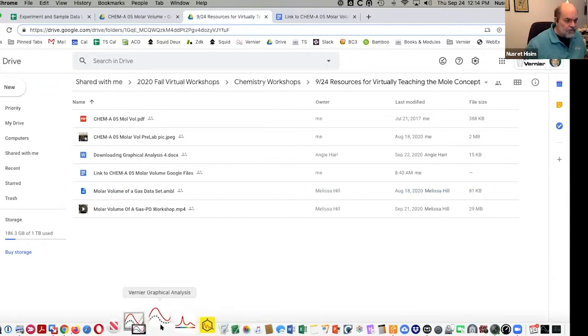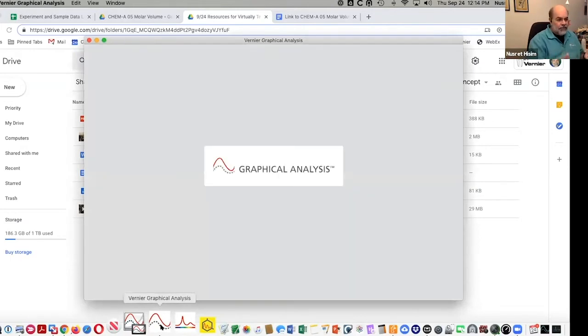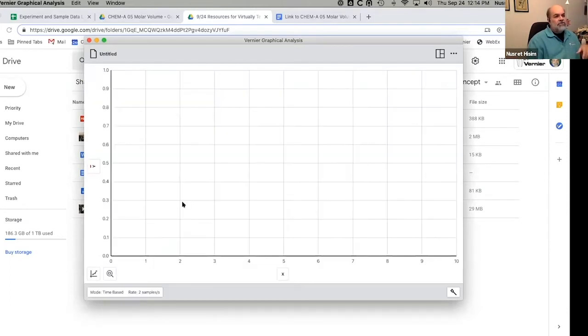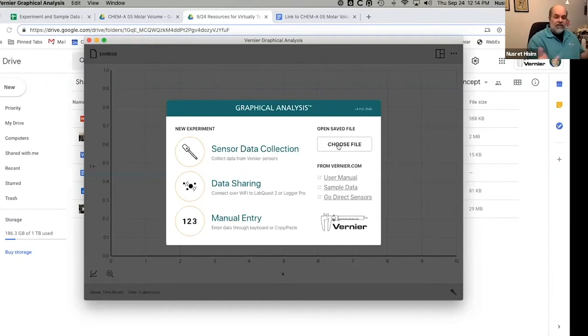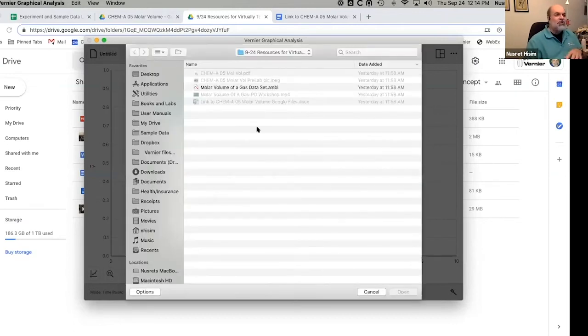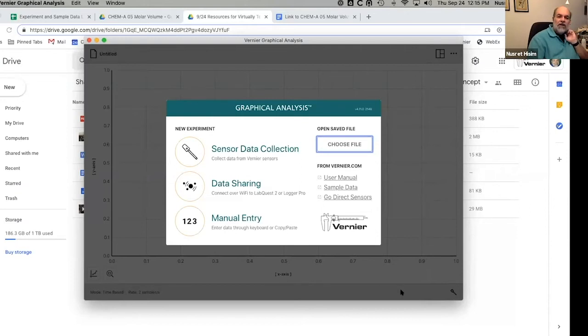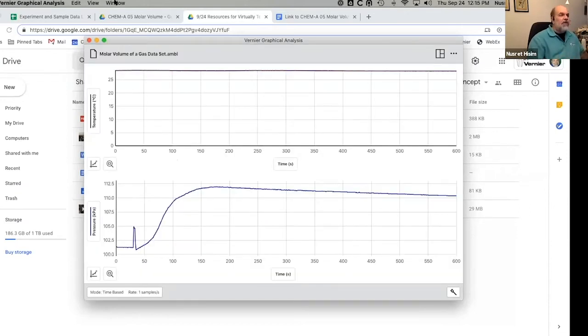So I'm going to open Graphical Analysis. This is the process you use anytime you analyze data in Graphical Analysis — you open the app, then use the 'Choose File' option if you have a file you've already collected and just want to analyze. I'm going to click on 'Choose File' and navigate to that file. I had already set this up earlier, so it went right there, but you would navigate to your downloads folder or wherever you saved it.